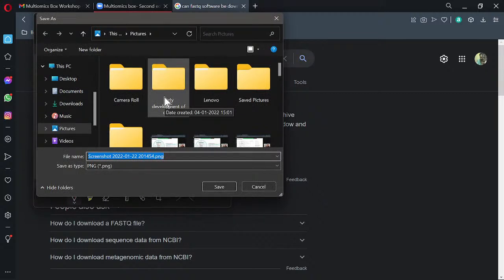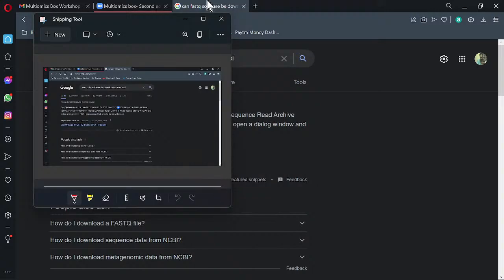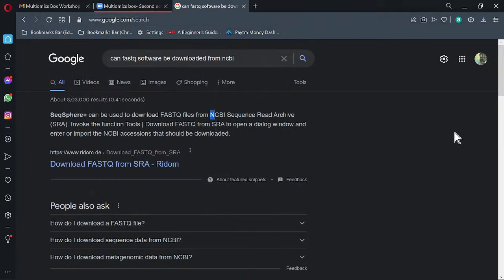Okay. So here I'm just showing you one example. That's it. You might have 50 samples, and with 3 replicates, that means you have 150 files. You might have 200 files. You have to perform the analysis individually with each file.